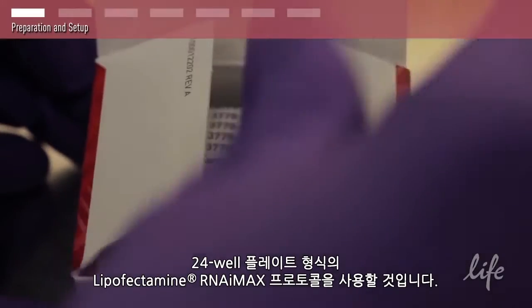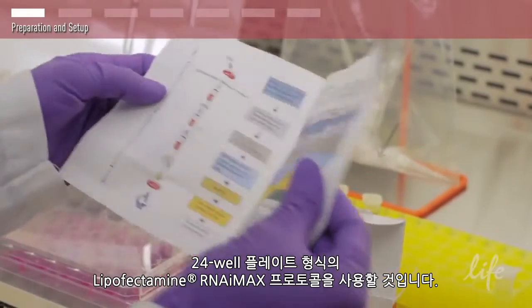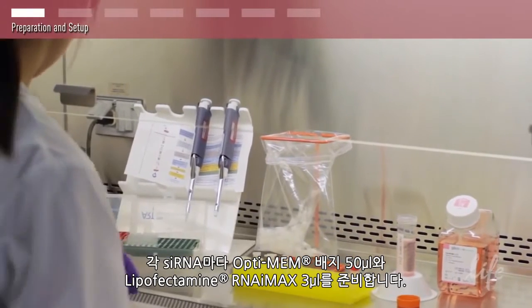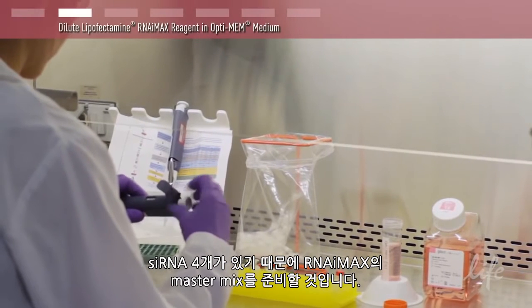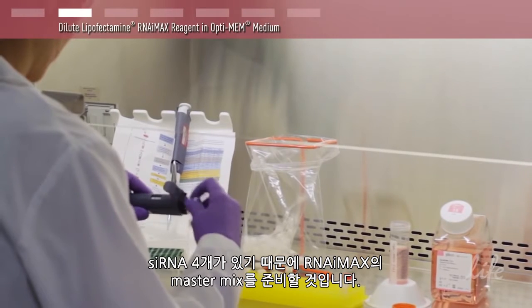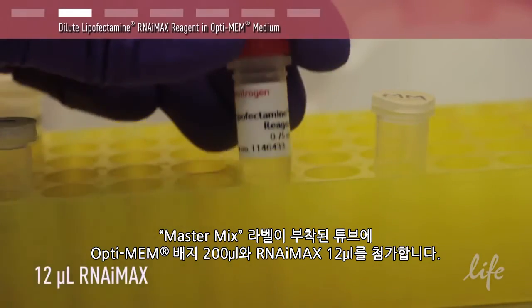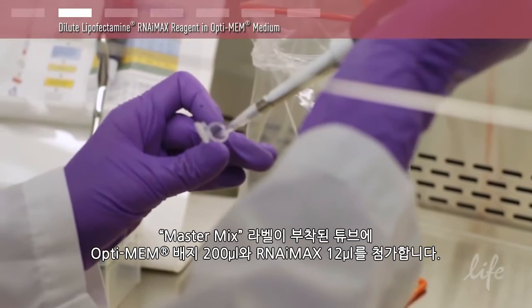We will be following the 24 well plate format of the Lipofectamine RNA IMAX protocol. For each siRNA, prepare 50 microliters of Optimem medium and 3 microliters of Lipofectamine RNA IMAX. Because we have four siRNAs, we will prepare a master mix of RNA IMAX. Add 200 microliters of Optimem medium and 12 microliters of RNA IMAX in a tube labeled master mix.